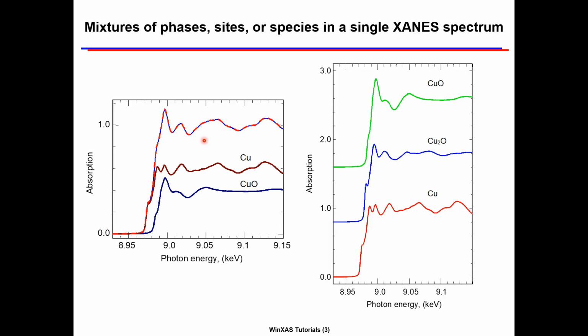First, any large enough number of reference spectra will eventually result in a good agreement between the sum of the spectra and the sample spectrum. This does not necessarily mean that all these phases are indeed present in the sample. Second, the validity of this approach relies on the database of references and the assumption that reference spectra of all chemical phases present in the sample are included.